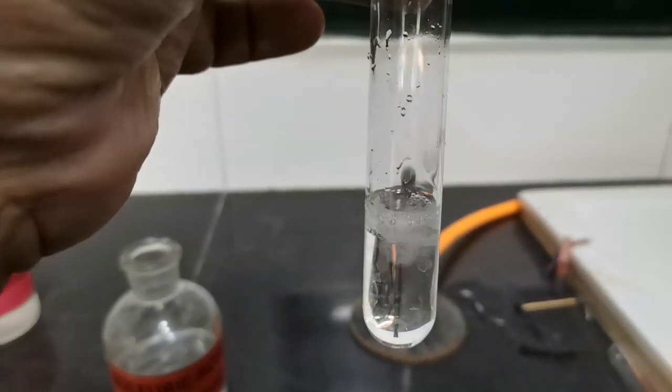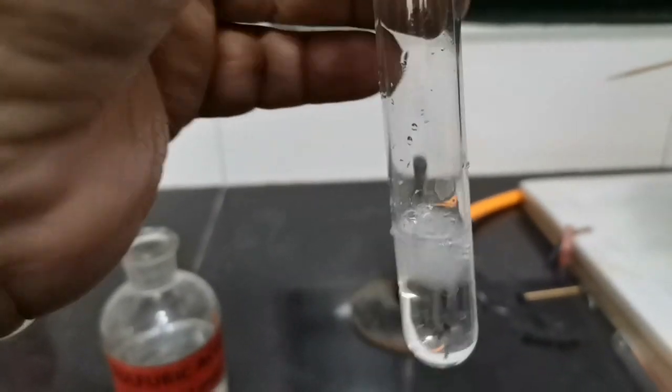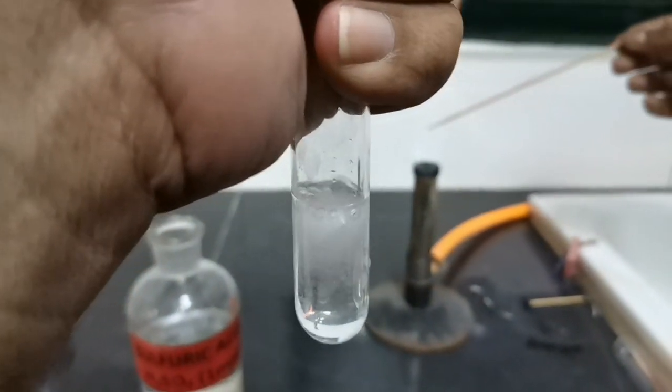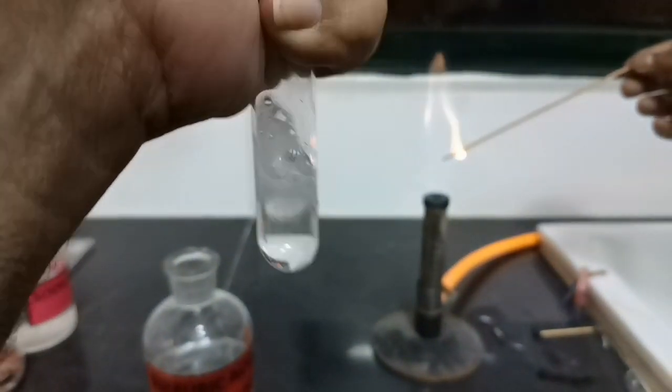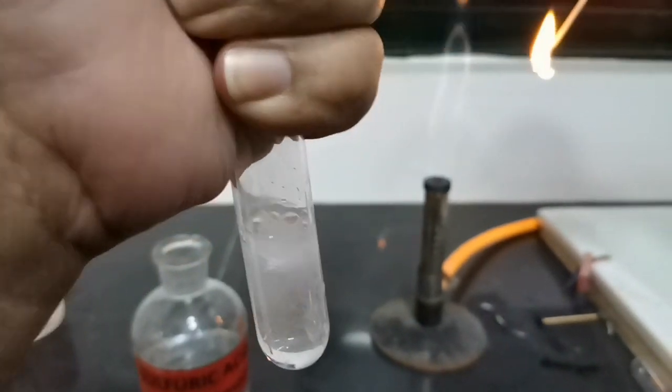Now we have added the magnesium ribbon into this tube and the magnesium has started reacting with the acid to produce hydrogen gas. I have placed my thumb on the top of the tube to prevent hydrogen gas from escaping and collect it.